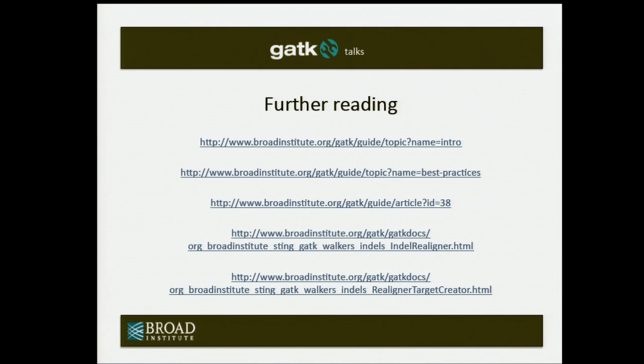For paired end, the duplicate rate is certainly lower than single end. Single end can have a lot higher duplicate rate. So for GATK purposes, does the program only look for paired-end duplicate reads, or any single reads that are also duplicates? Are you talking about mark duplicates, or the indel realignment? No, mark duplicates. Mark duplicates does take into account the paired end reads. Is Mauricio still here? Can you confirm that? Mark duplicates is pair aware, right? Yes. So the answer is yes.